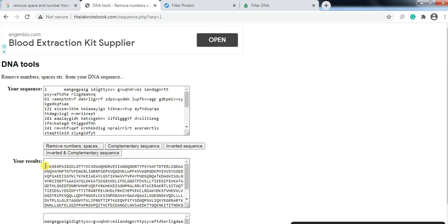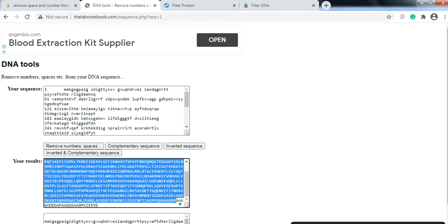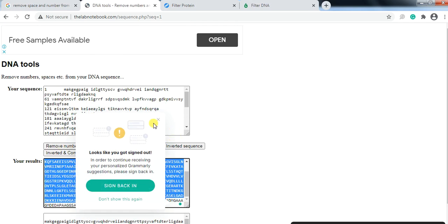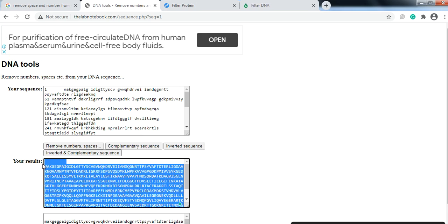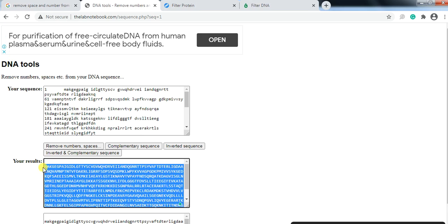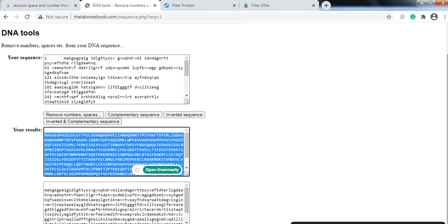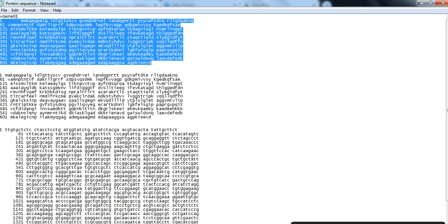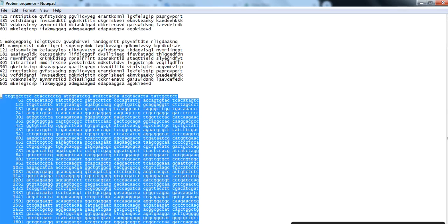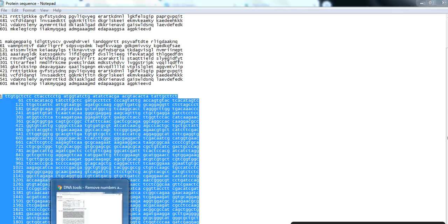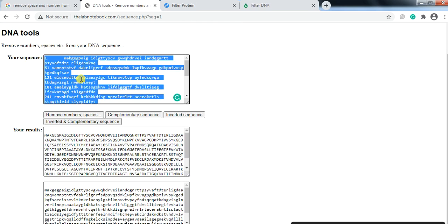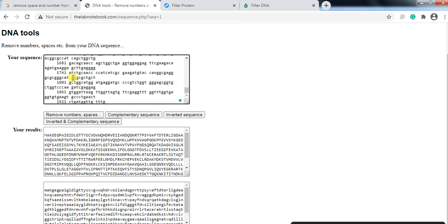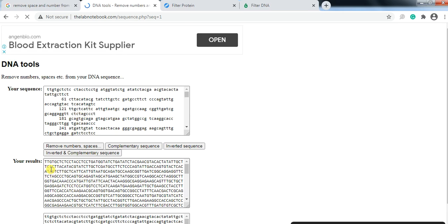So you will get your sequence that doesn't have the space and number. You can copy this either in uppercase or in lowercase, anyone that you want to copy and paste and use. If we use our DNA sequence, paste it. So here if you click on remove number and space it will remove all the number and space from here.